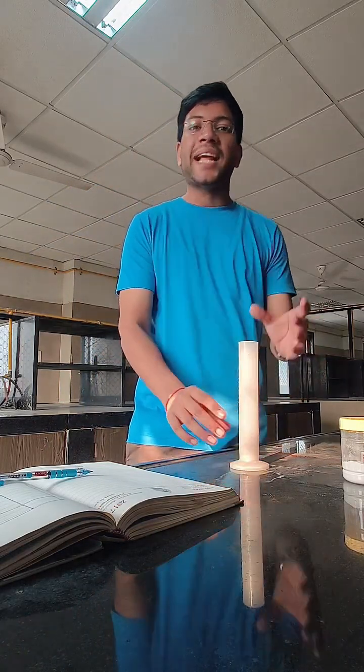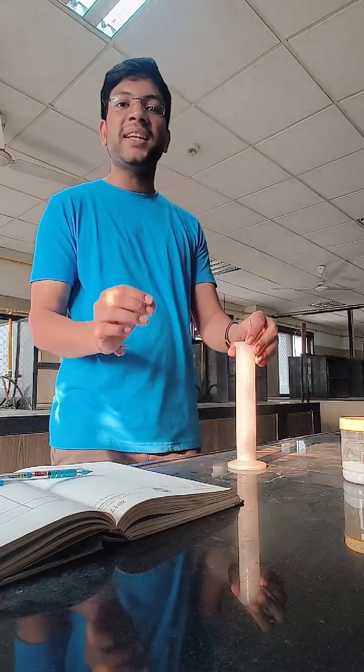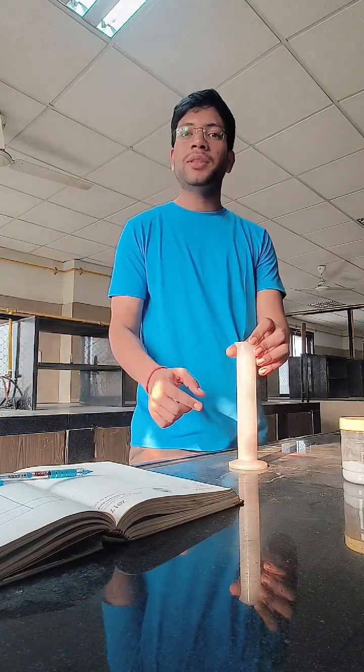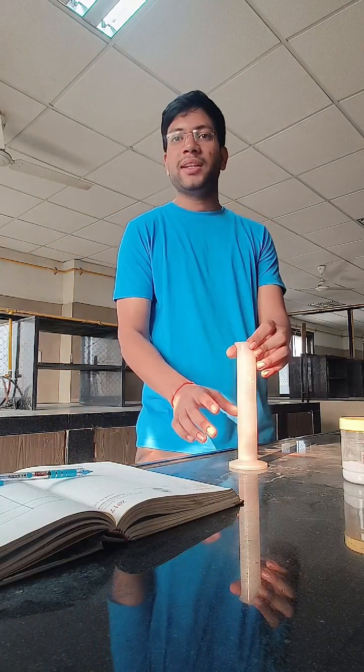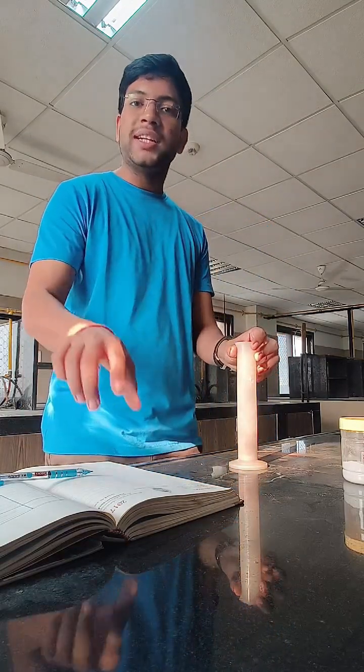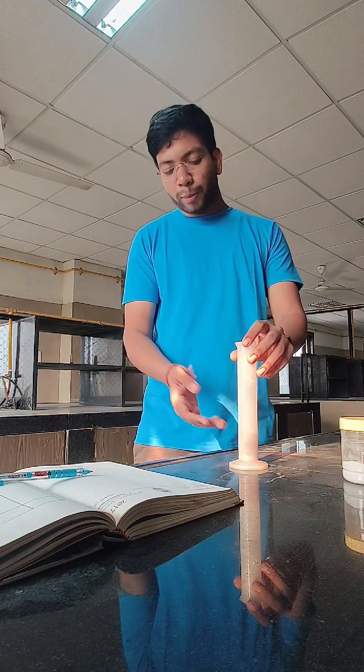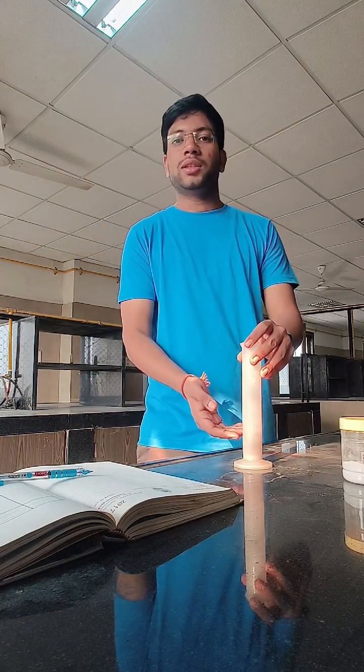After tapping it 10 times, there will be a significant decrement in the volume of the powder. Then we will again tap it 10 times and there will be again a decrement. After each interval, we will note down the reading and we will keep doing this procedure until the volume of the powder becomes constant.